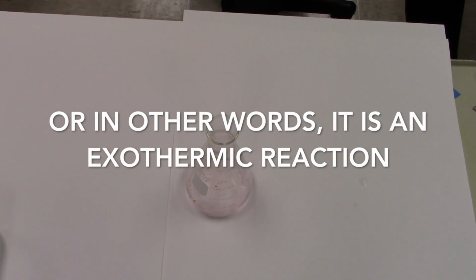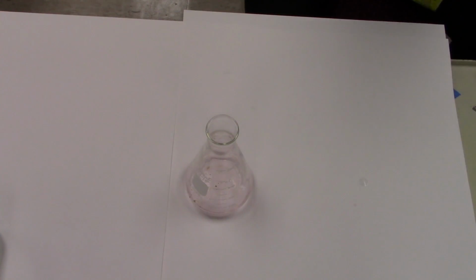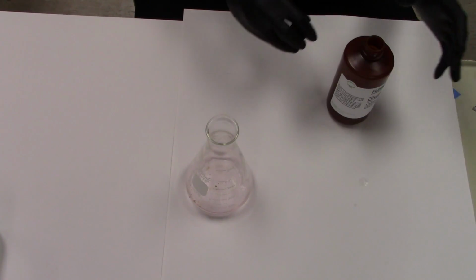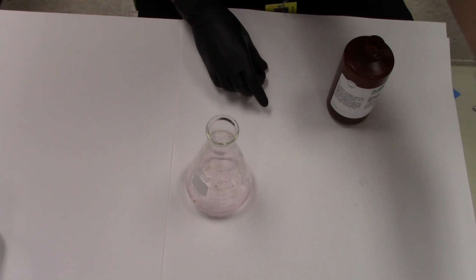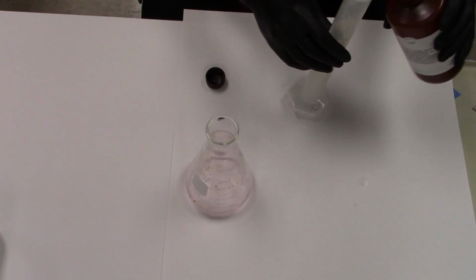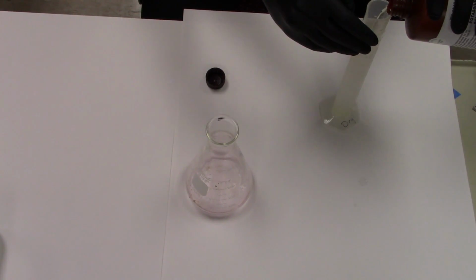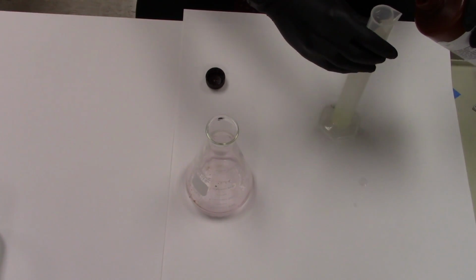And it's going to get really hot. Because with energy, you can't make a reaction take place without energy. When bonds are formed or when they're broken, there's energy released during that. So some reactions are not very energetic, whereas others are. And this one's quite energetic.